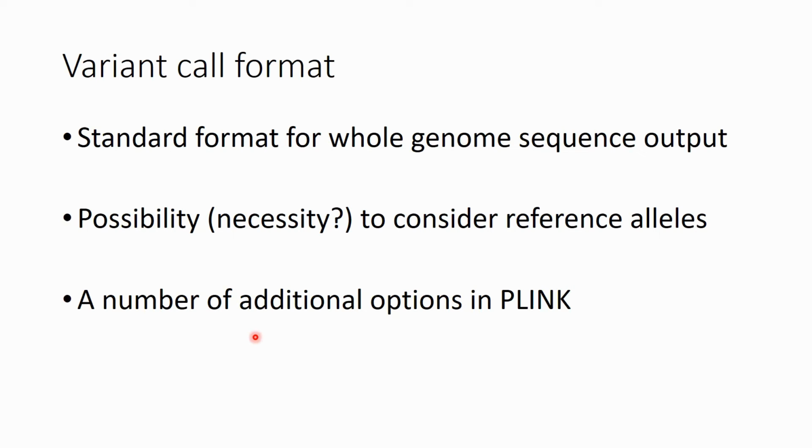Here, I also want to warn you that there is also a possibility or even a necessity to consider the reference alleles. There are a lot of additional options and possibilities to do so in PLINK. So if you are loading or dealing with VCF files, I definitely recommend to check these out in detail.